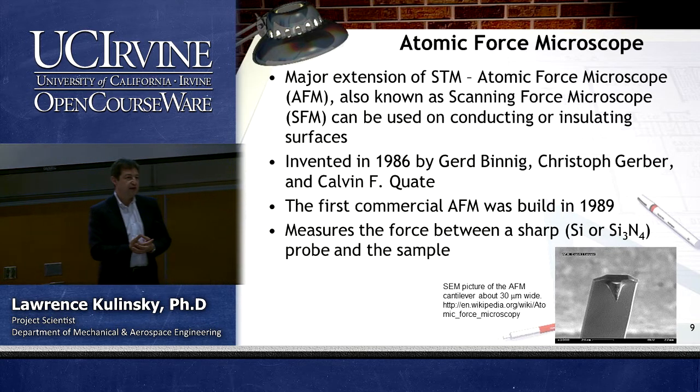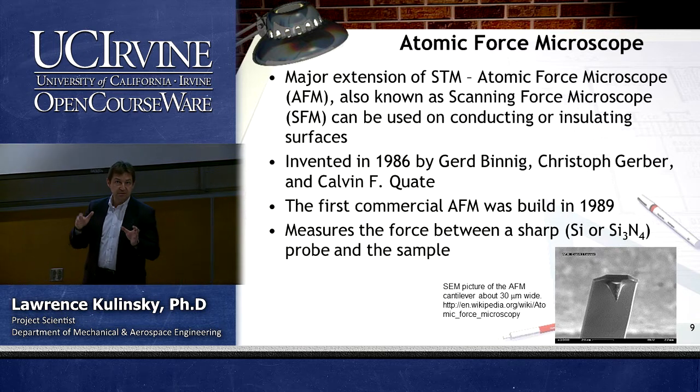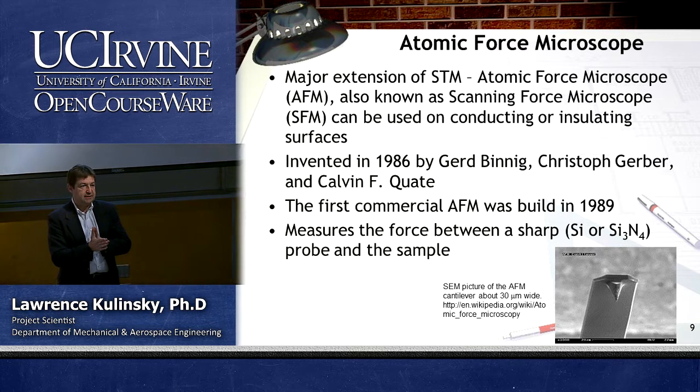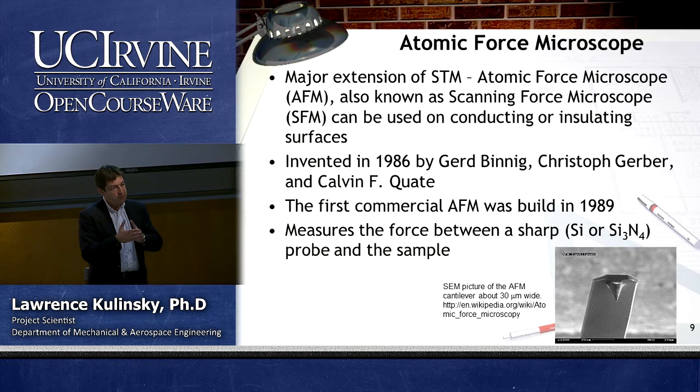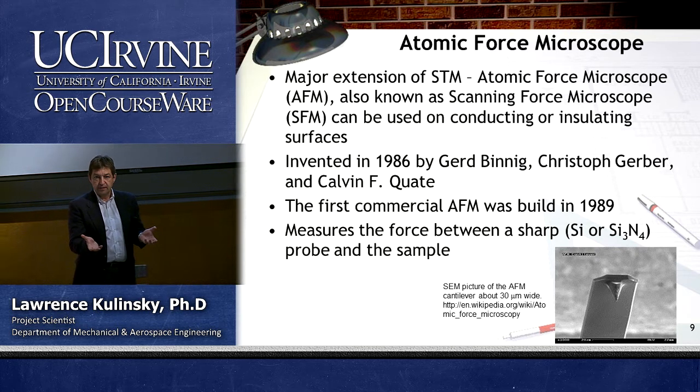And the precursor to that invention is, let me outline the main problem with STM. As we discussed, the way to measure surfaces with STM is via tunneling current, right? So what does it tell you about the surface? What kind of surface should your sample have?